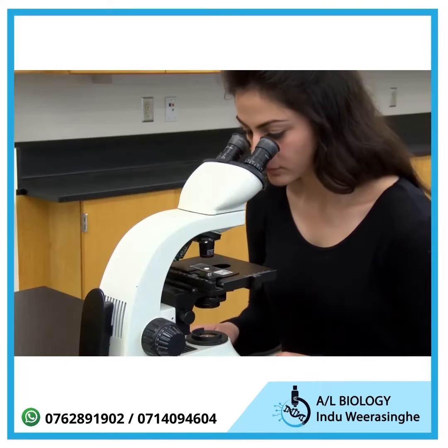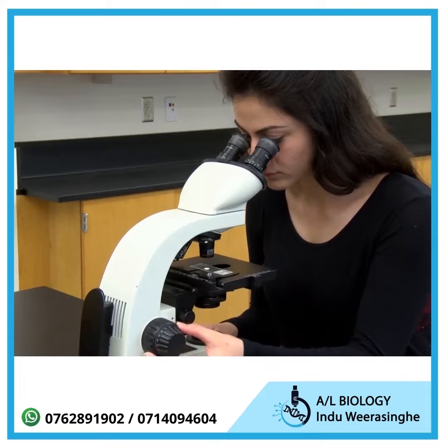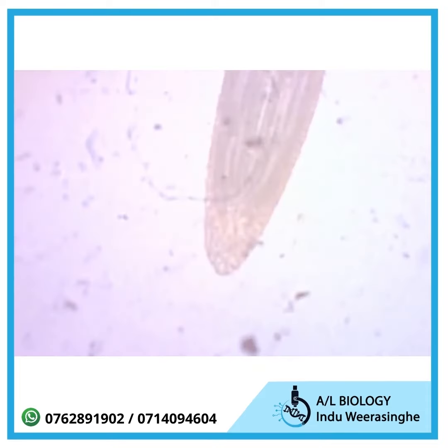Start with the low power objective lens, 4X, and the stage in its highest position. Then look through the ocular lens and focus on the specimen, which should already be nearly in focus.